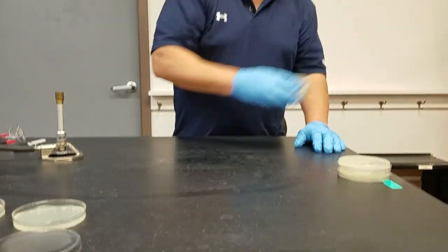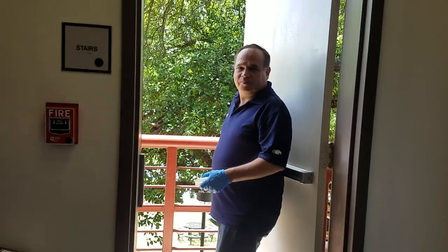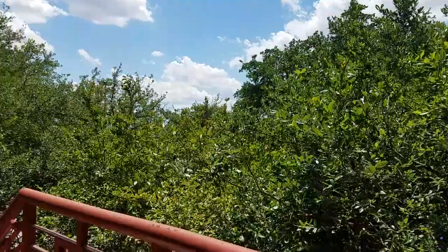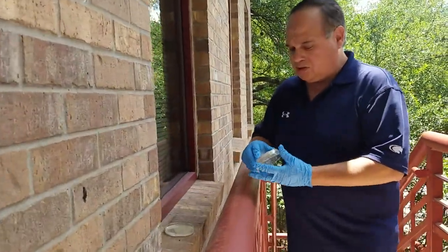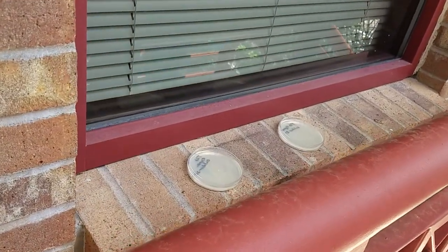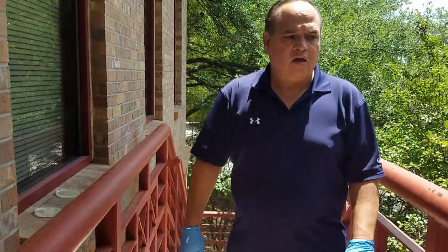These two plates I'm going to take outside to our balcony here at the Riverside campus — my favorite of all campuses, it's just beautiful. I'll come over to this area, open up these plates, and let them be exposed to the outdoor environment for about 20 minutes. Then I'll come back, pick them up, and take images of the results from those not exposed, those exposed indoors, and these exposed outdoors.